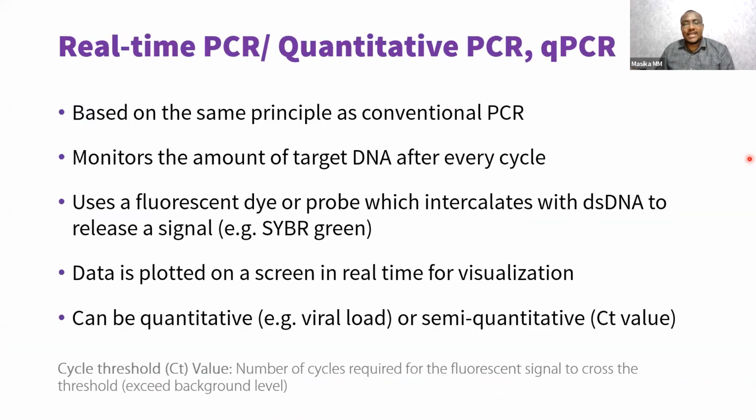The other thing I would like to highlight is real-time PCR. Sometimes it's called RT-PCR, but some people will use RT to mean reverse transcriptase PCR, so be careful. Real-time PCR is also called qPCR or quantitative PCR, although it can be quantitative or semi-quantitative. I'll show you what that means. It is based on the same PCR as conventional PCR, as we've seen. But what I have shown you before is called endpoint PCR. You see the results at the end. For real-time PCR, you can see the results as they happen.